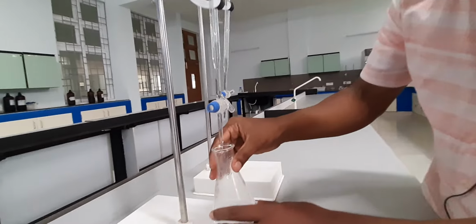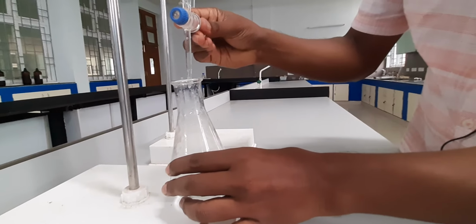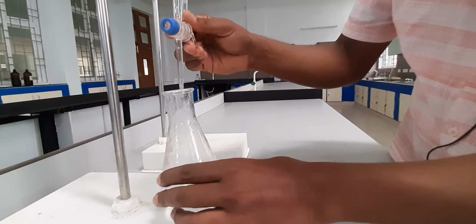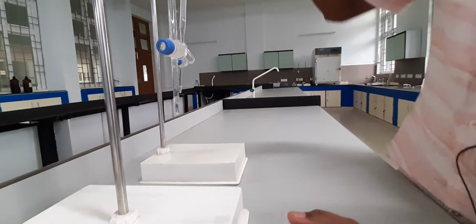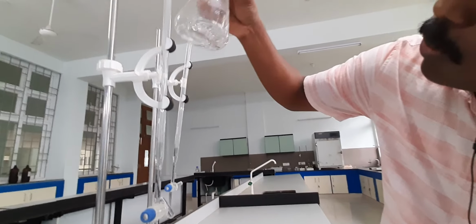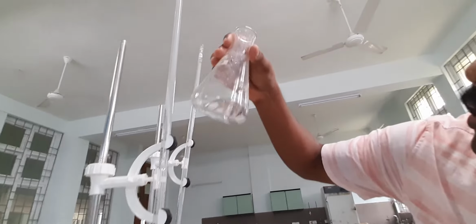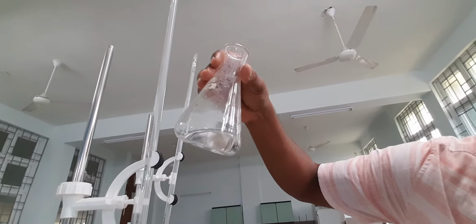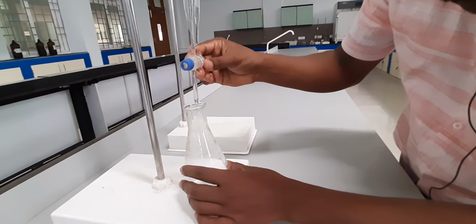You have to add slowly, shake it well, and then add again. That is the way you should go on. I'm just adding a little and observing the situation inside the conical flask. I can still find a homogeneous solution. I don't see any haziness or turbidity. So till I reach a turbidity, I will add.